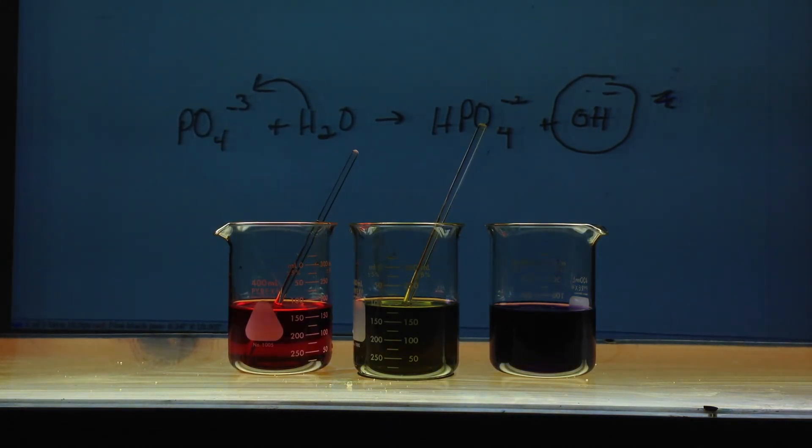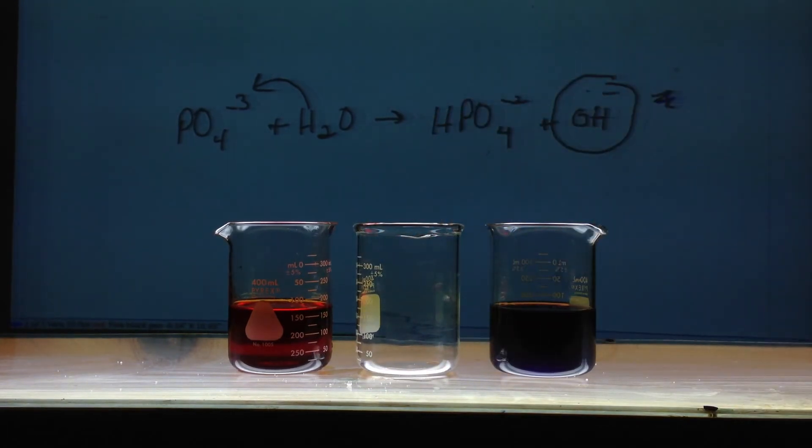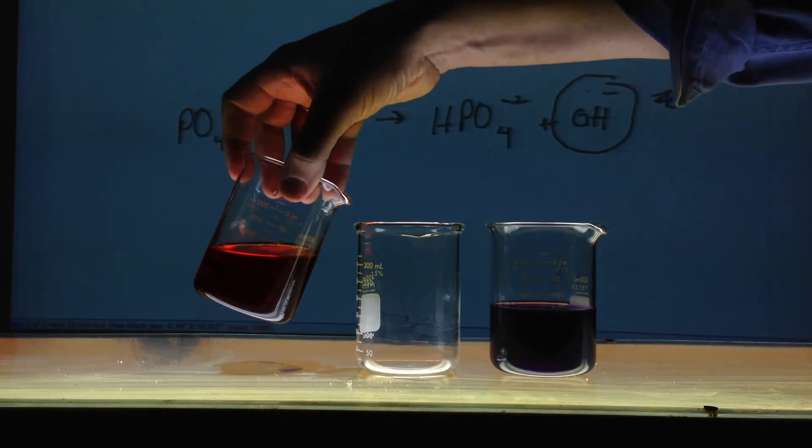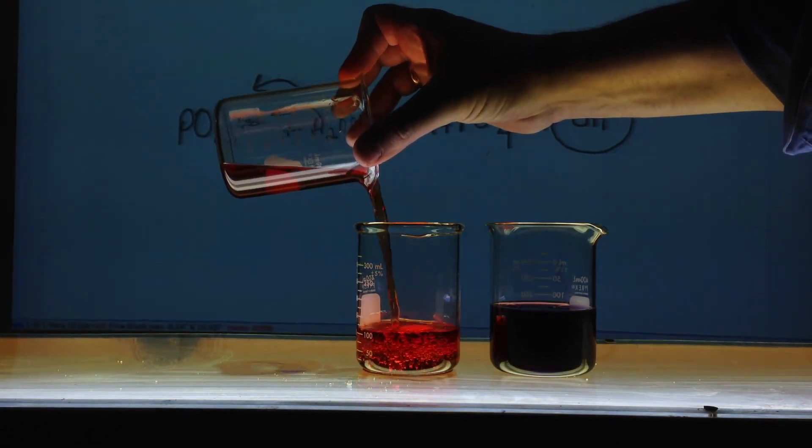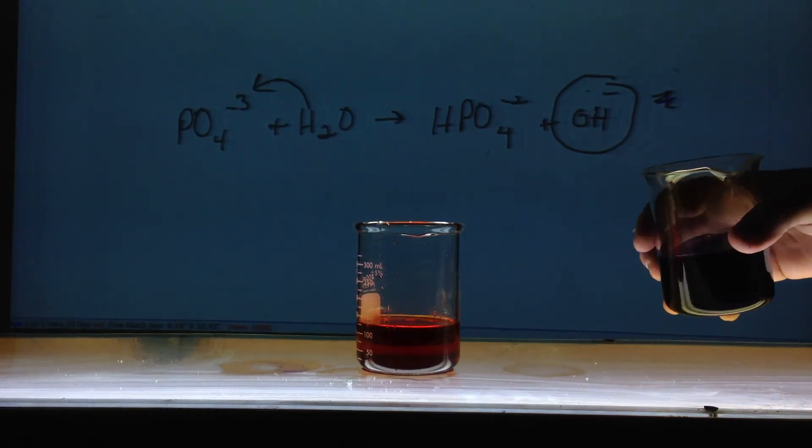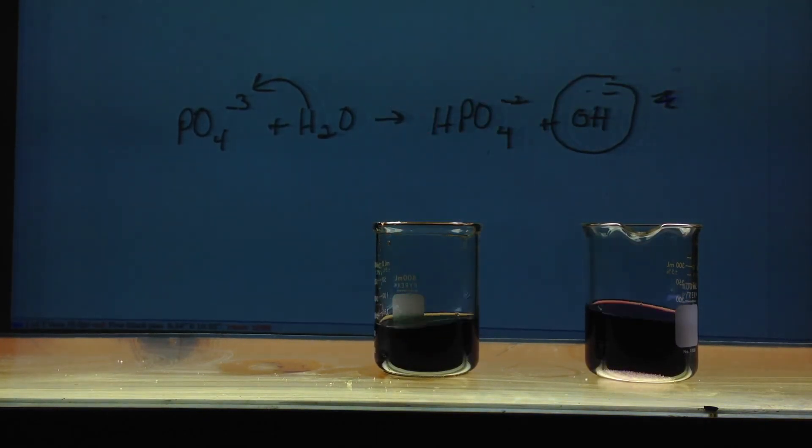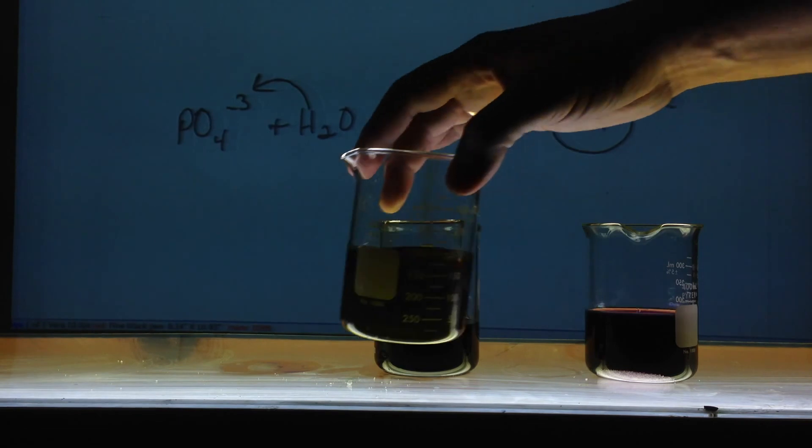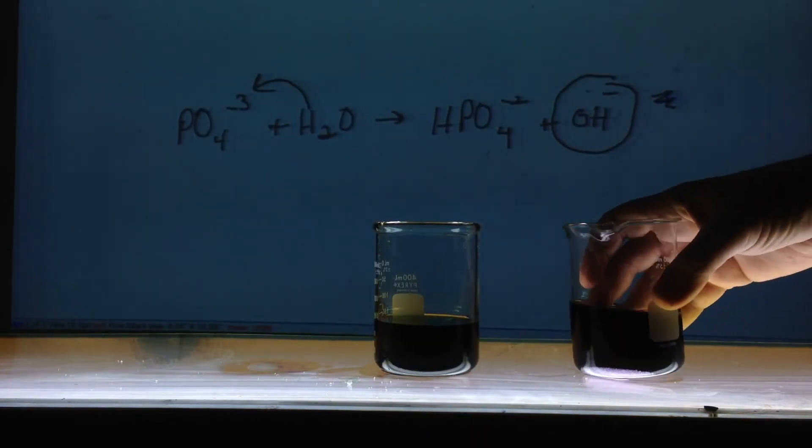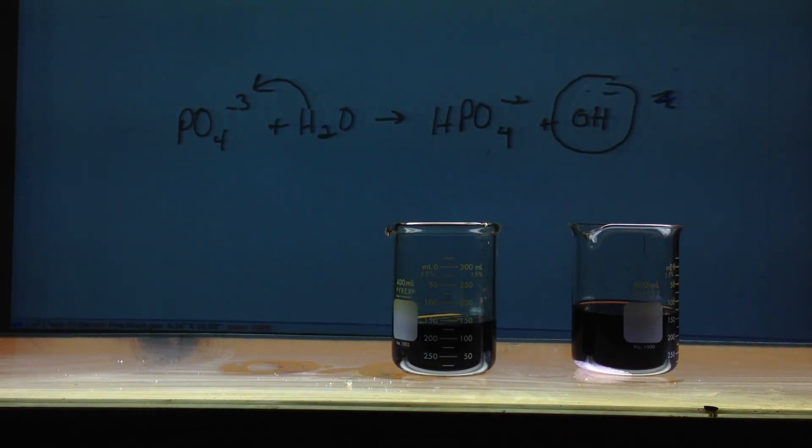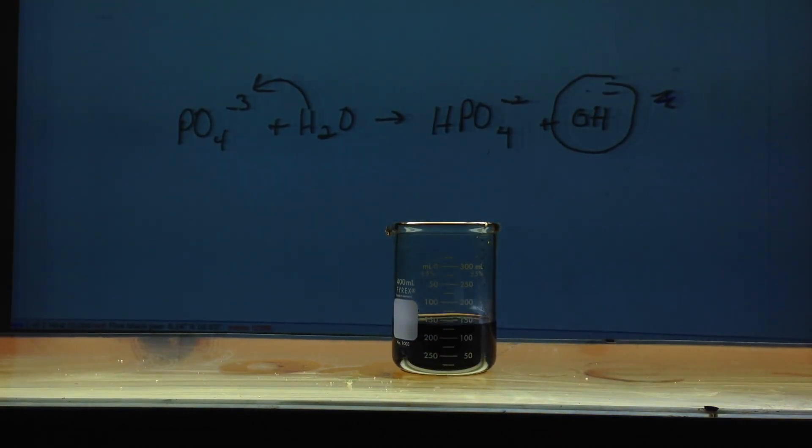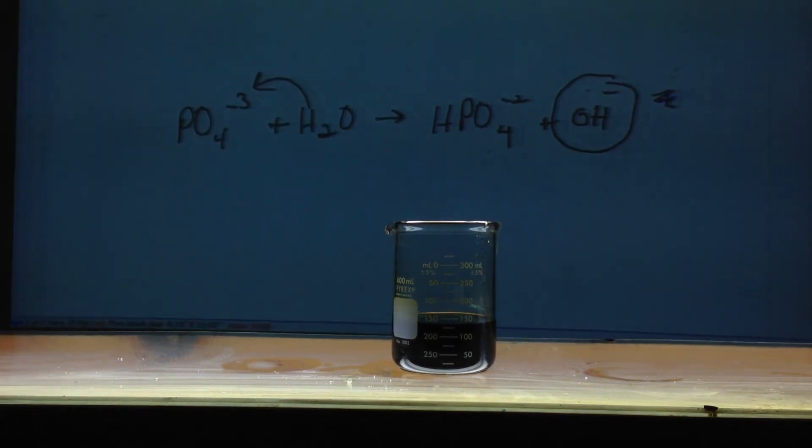Interesting enough, let's pour some together. Let's take a beaker. And, let's start with some ammonium nitrate, which is acidic. And, it's red. And, now I'm going to add some of the basic blue here. And, look what we get. We get our green color, just like our sodium chloride. Add too much, and so basically we neutralize the solution with two salts that have ions that act as acids and bases. So, we got the green neutral color by mixing ammonium nitrate and sodium phosphate together. Hope that helped.